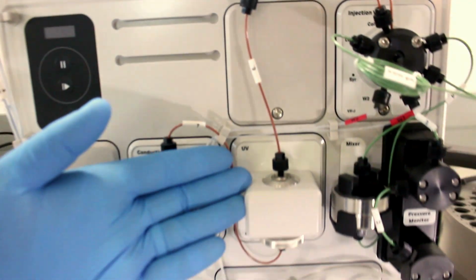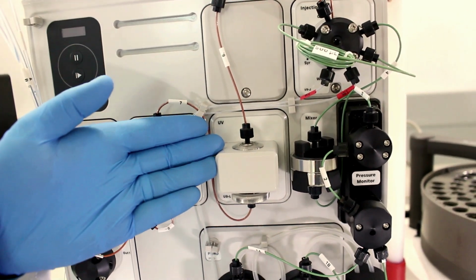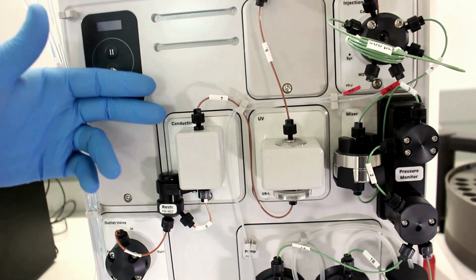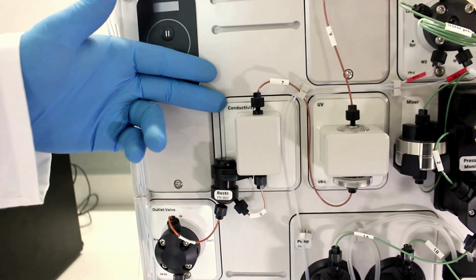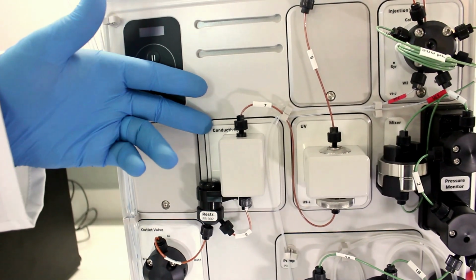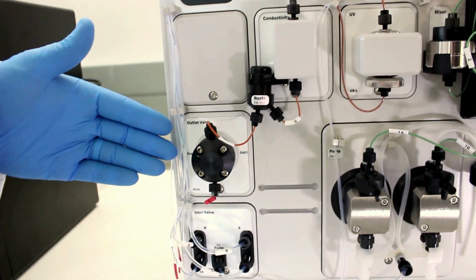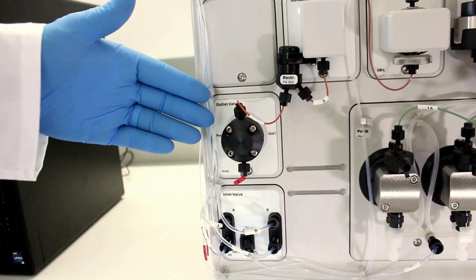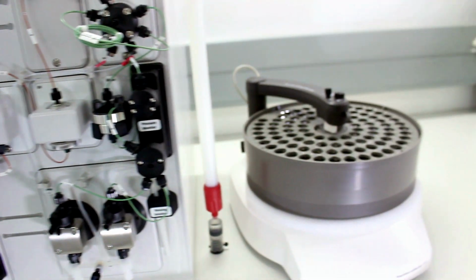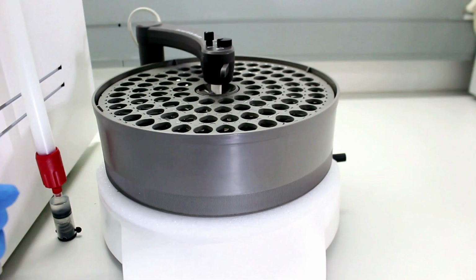Separation will take place in the column, and from there the flow will go into the UV detector. The UV detector is set at 280 nanometers, which is the absorbance maximum for the majority of proteins. From there, it goes to a conductivity meter, which measures the gradient and makes sure that no mistakes happen during your chromatographic run. From the conductivity meter, it will go to the outlet valve, where it will go either to waste or to the fraction collector, if that is an accessory that you included in your system.